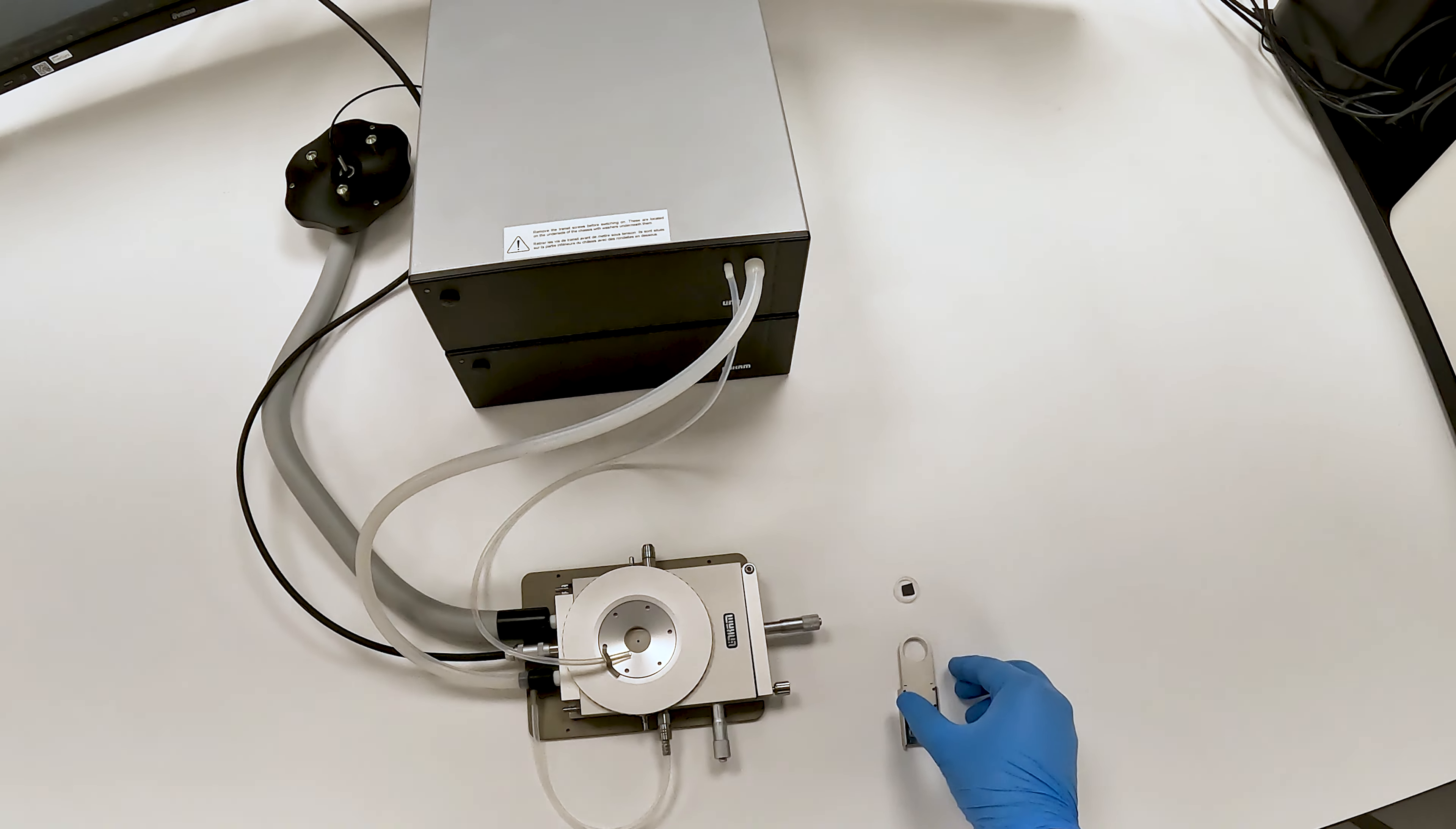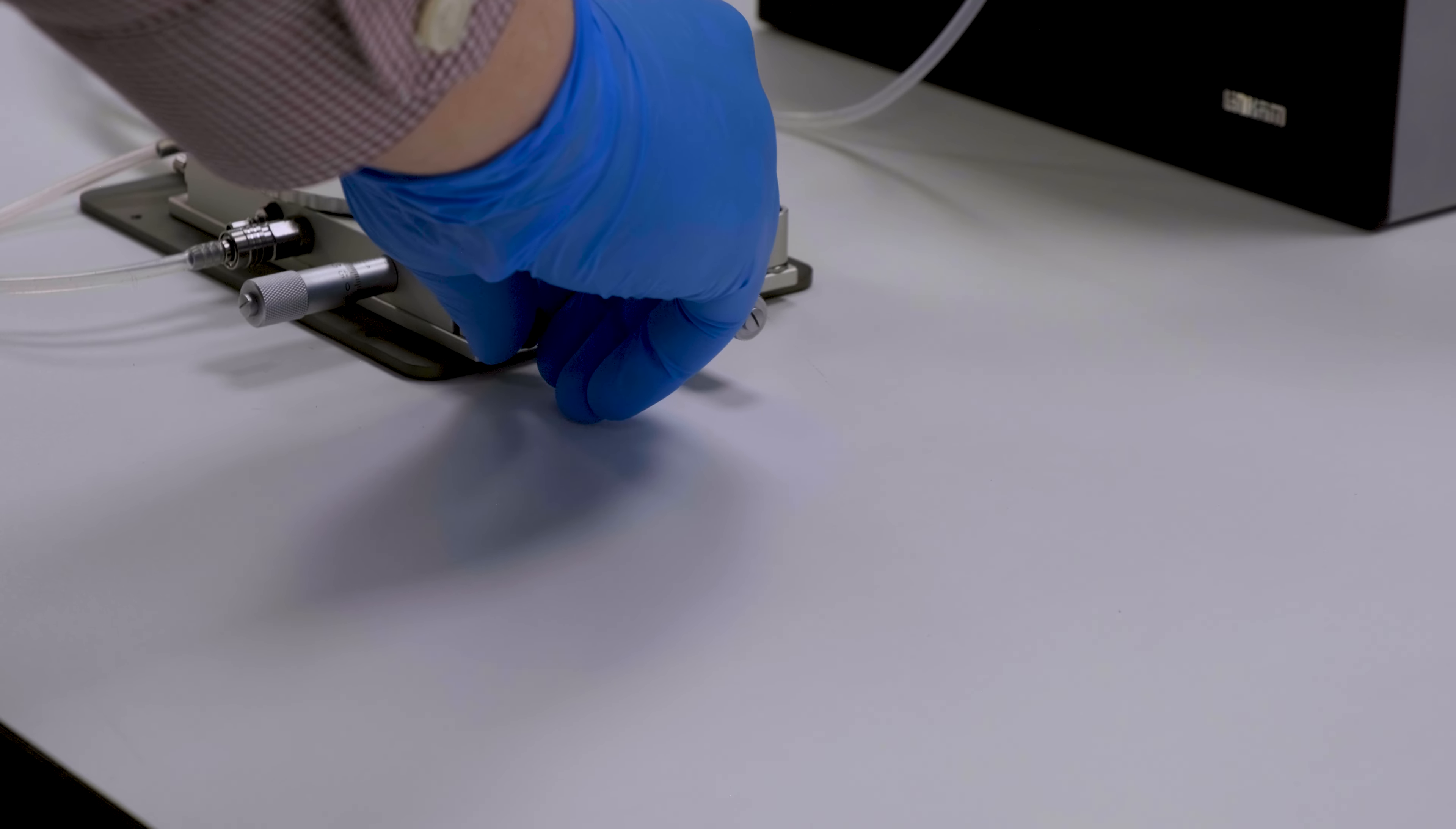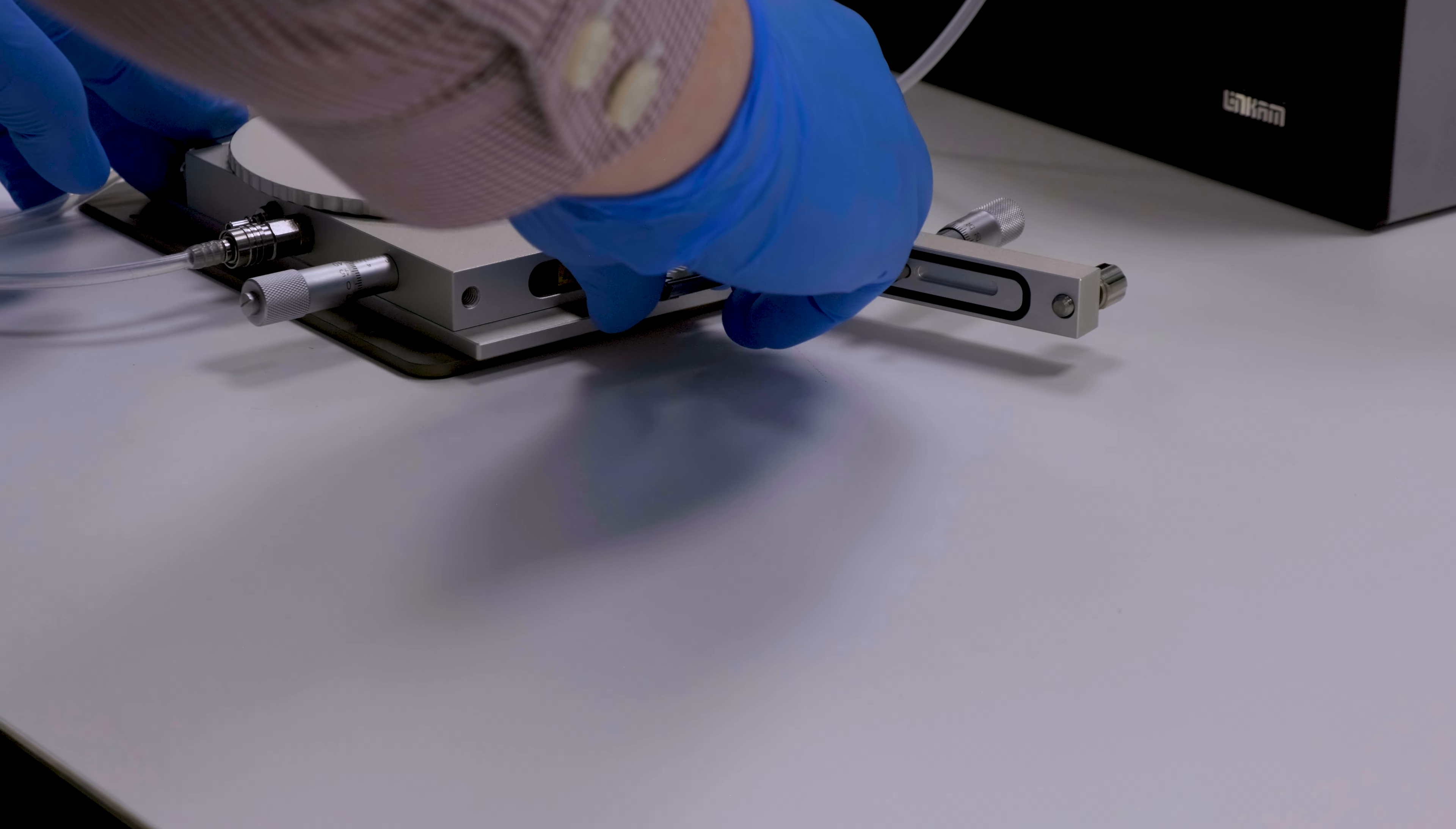The sample can now be loaded into the stage. Among the accessories are quartz sample substrates and a holder to position the sample underneath the microscopy window. In this video, we will be using a silicon chip. Open the door on the side of the stage and insert the sample, then close the door and secure it.